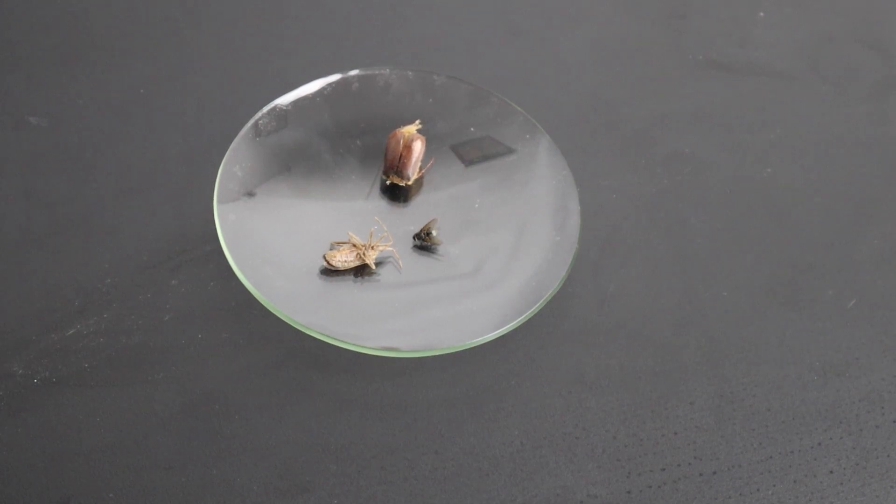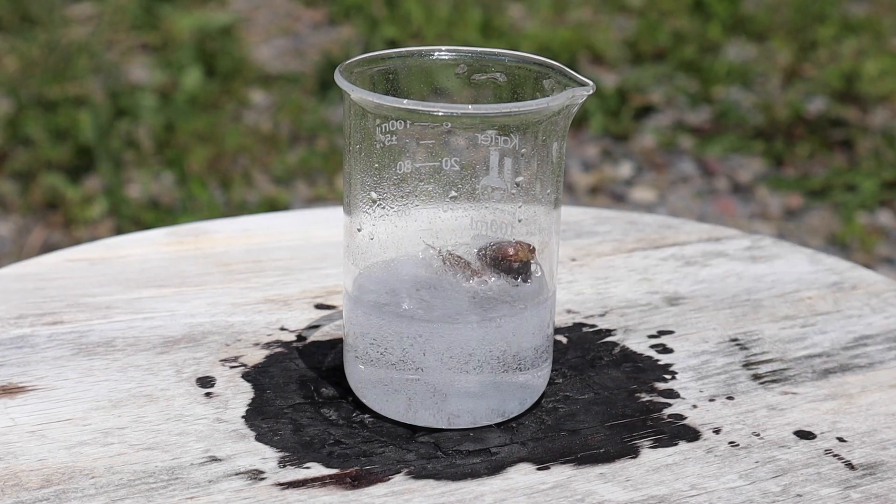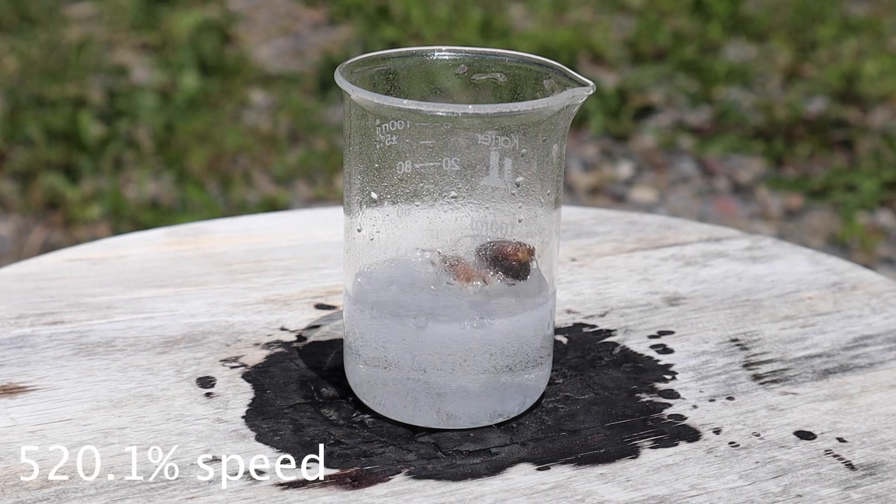After the ham, people on TikTok suggested that I try some insects. And as I expected, they were completely obliterated.